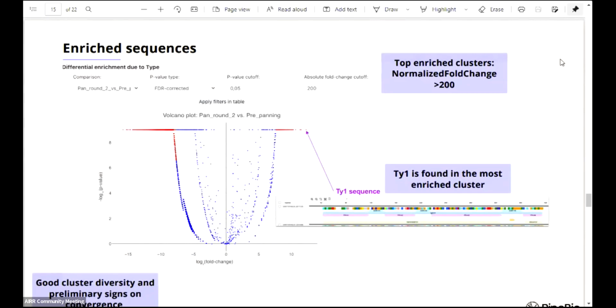After that, we run a differential enrichment, and the output of that is a volcano plot where, as you're well aware, in the upper right corner here, we have the most enriched sequences based on fold change and statistical significance. And luckily enough, the one highlighted here in the very top right corner is the same sequence as they found in the research paper. So it's the most differentially enriched sequence, and we picked that one as well, which is lucky, I guess.